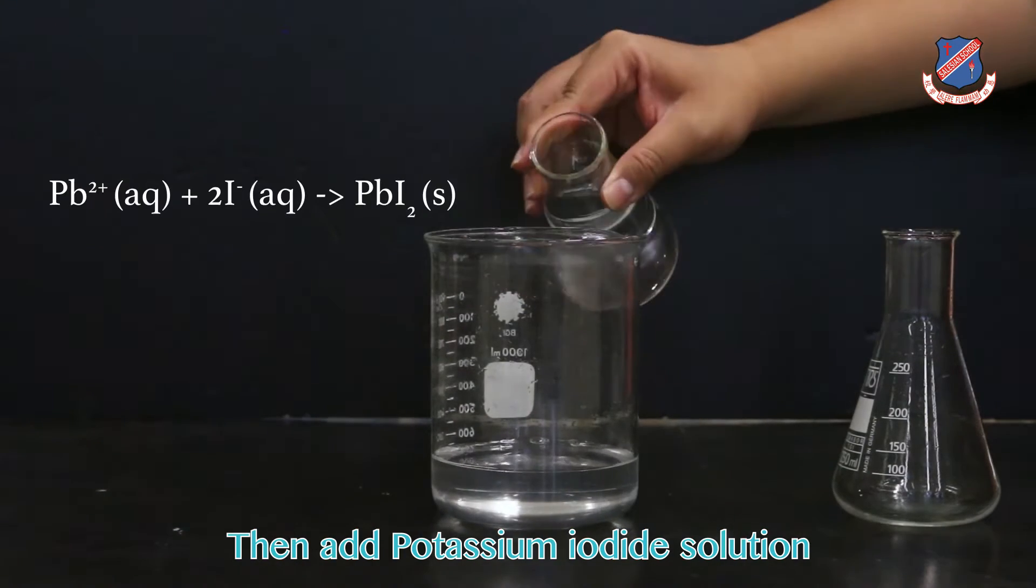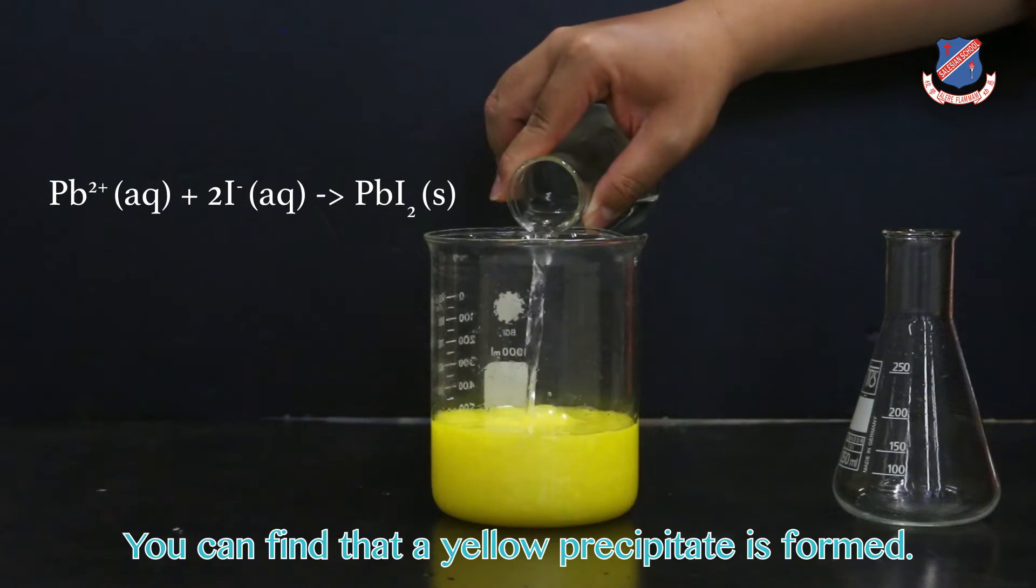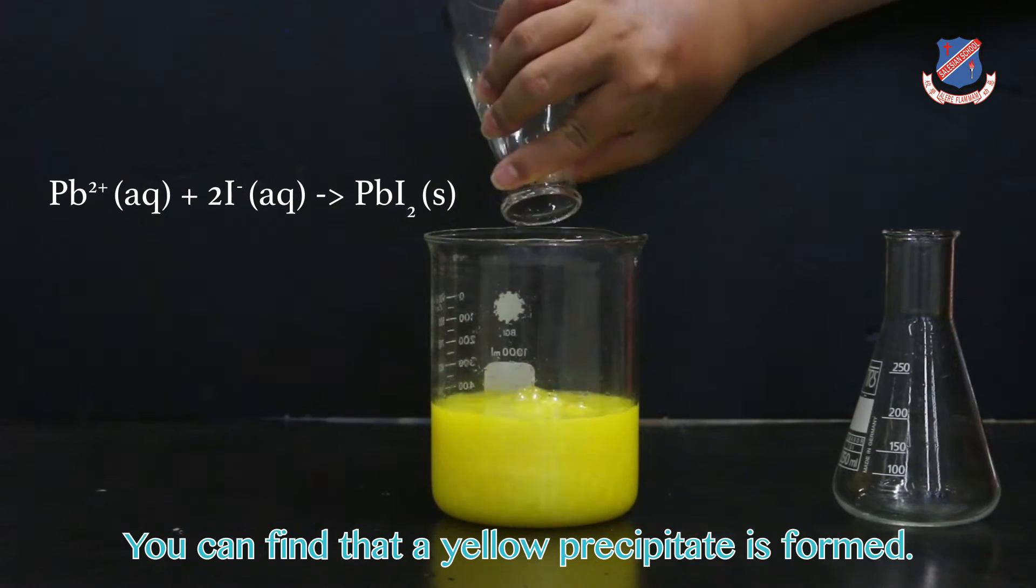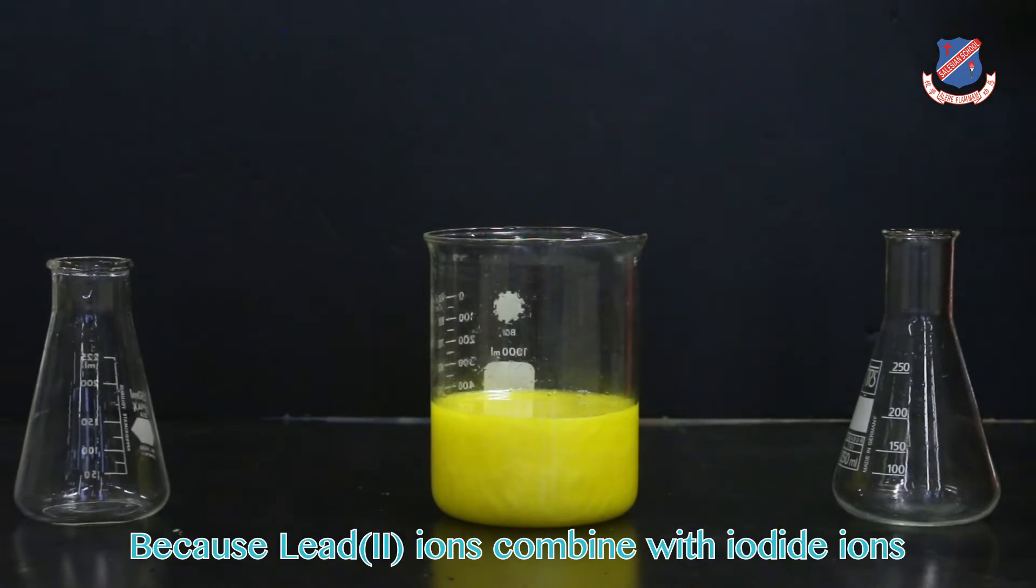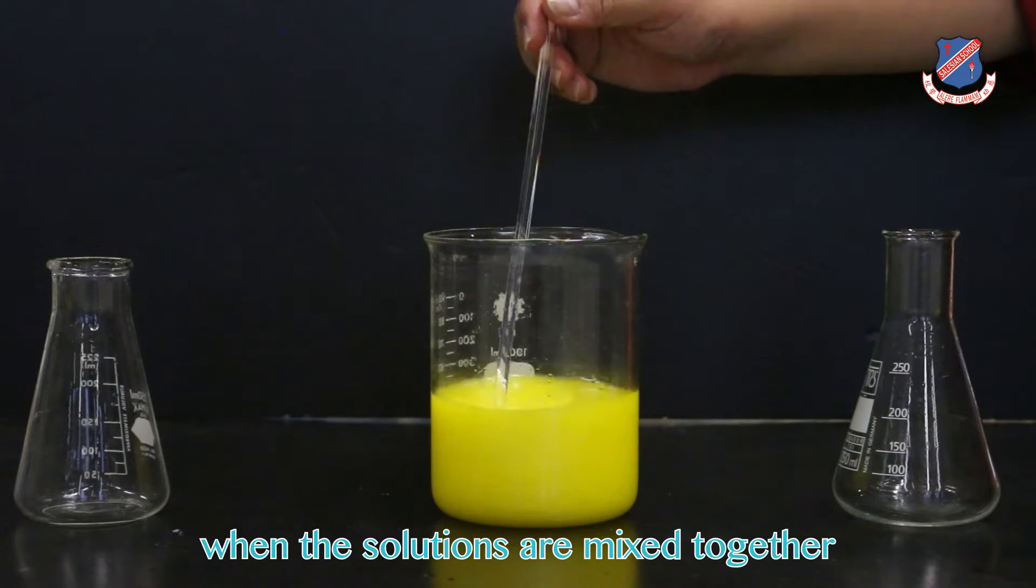Then, add potassium iodide solution into lead(II) nitrate solution. You can find that a yellow precipitate is formed because lead(II) ions combine with iodide ions when the solutions are mixed together.